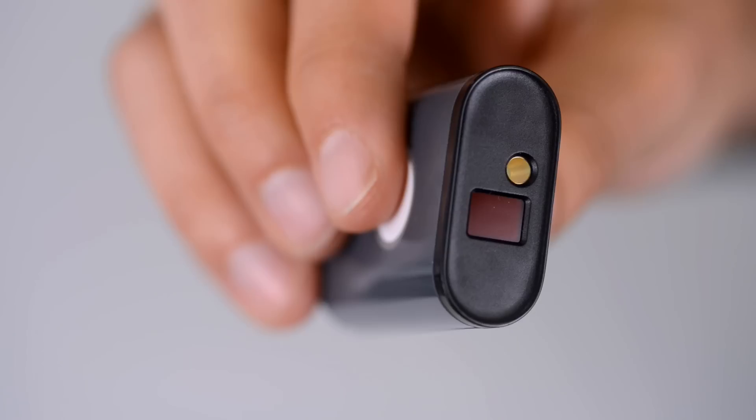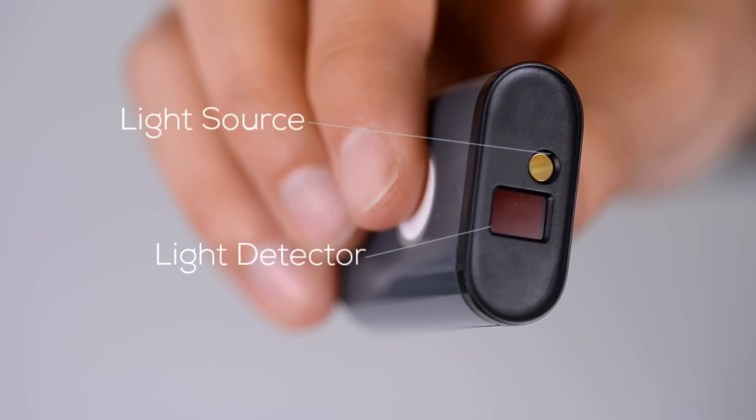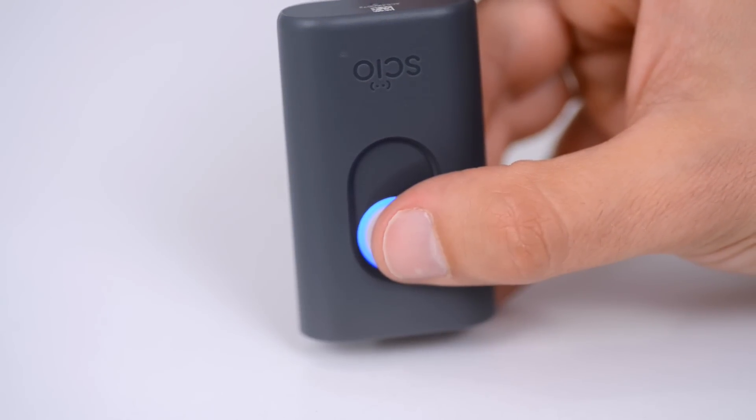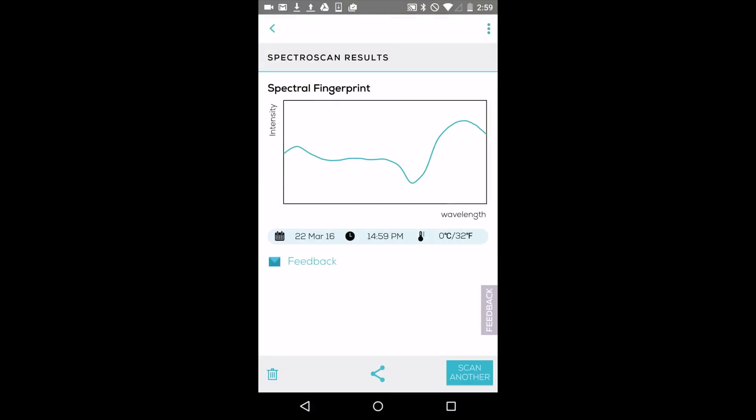So how does Sayo work? The Sayo sensor has a light source and a light detector. Some versions also have a temperature sensor, but we removed it from newer versions since it's not required for accuracy anymore. When shining the light on an object, the reflected light is captured by the molecular sensor and translated into a spectrum — that's the object's unique molecular fingerprint. Sayo can be taught to provide you with specific insights based on that unique molecular fingerprint reflected from objects you scan. So that's Spectroscopy 101. Let's start using Sayo.